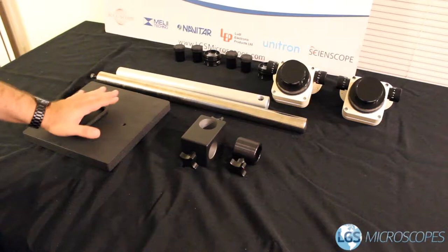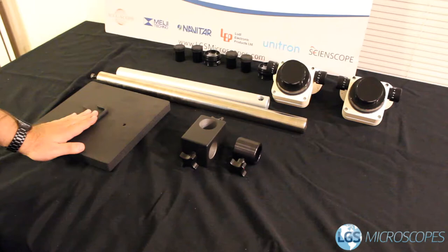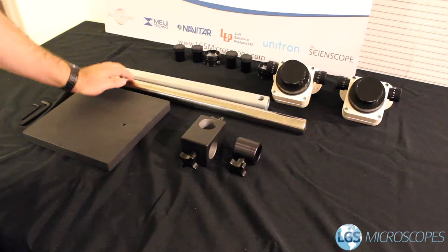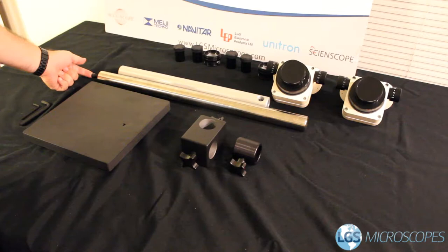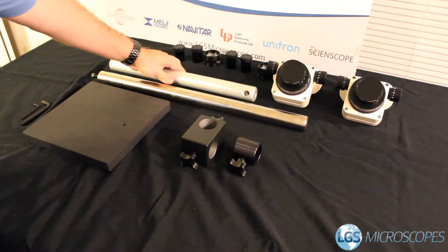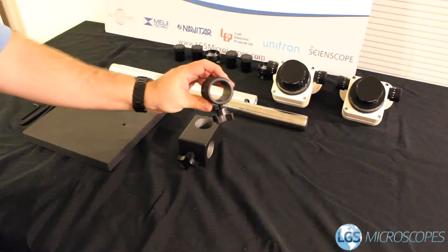Next we're going to assemble the stand. This is the only part that's even somewhat complicated but I'll walk you through every step. It comes with everything you need, including two tools. This piece is the base, which weighs 29 pounds so be careful when you handle it. This is the vertical pole — it's longer than the horizontal boom arm and has a screw in the base. This is the horizontal boom arm — it has a trough that runs the length of it and holes in the end for bonder pins. Then we have the knuckle and, very importantly, the safety drop collar.